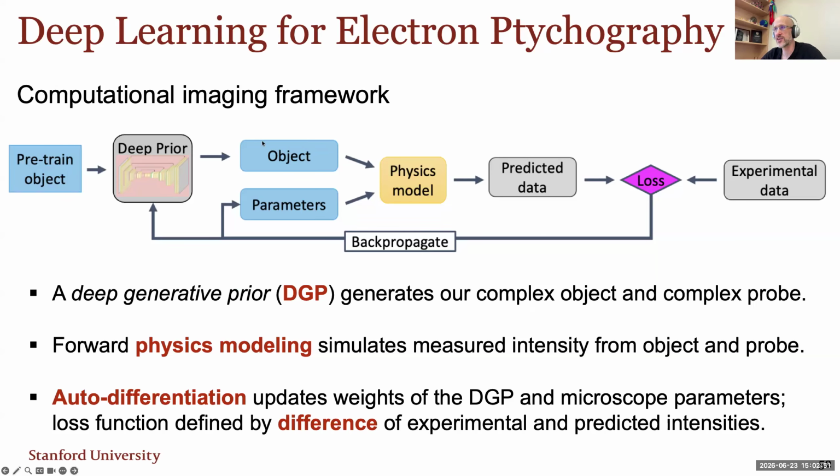But the thing I would add into it is generate the phase and generate the intensity using an INR, some kind of deep prior, right? And so everything from the deep prior onwards here should probably just be ShelX or whatever physics model you would use for 3D electron diffraction. So that's my advice, but feel free to email me if you want more opinions on that. We want to try it too. We just haven't gotten to that one yet.